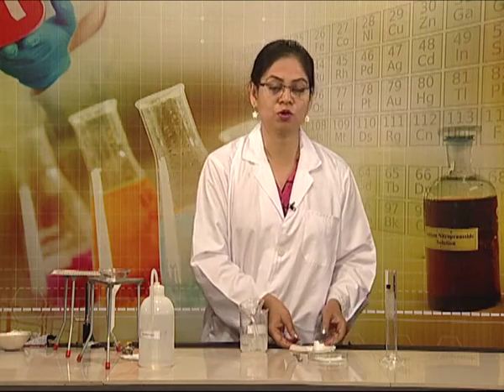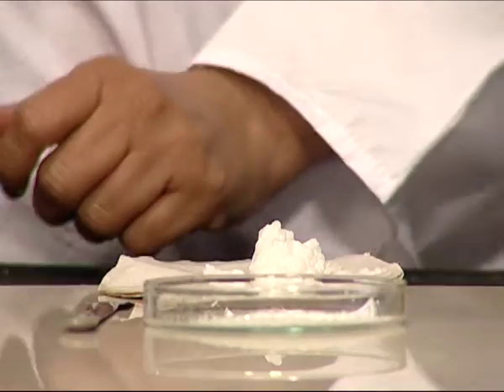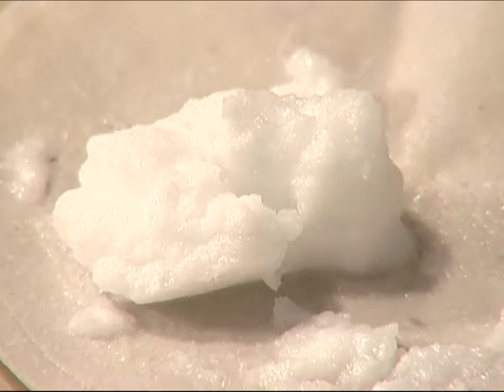This will remove excess water present in the crystals. Allow the crystals to dry at room temperature.